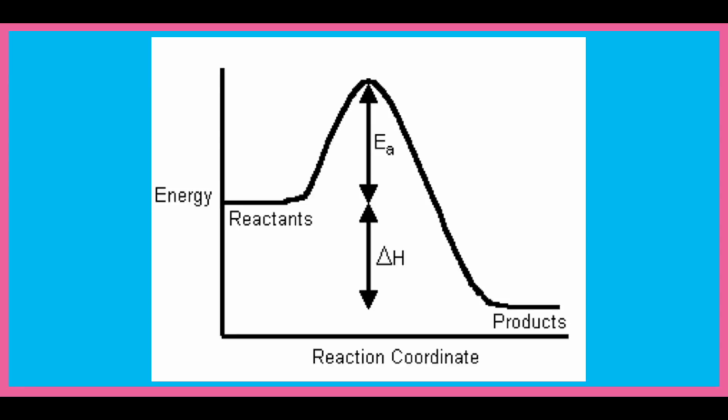So in order to get the magnesium to turn into the oxide, not only do we need oxygen, but we also need a substantial amount of energy, which is in the form of heat from the Bunsen burner.